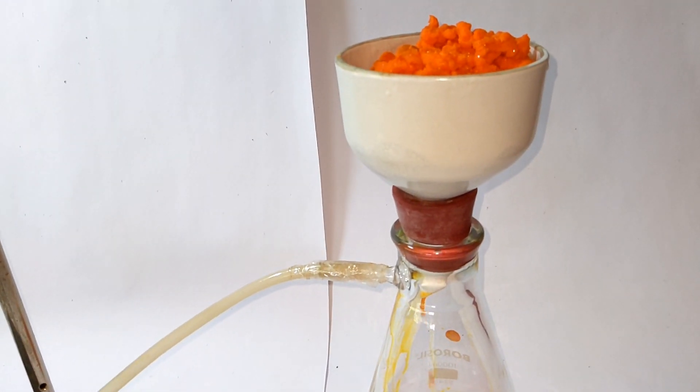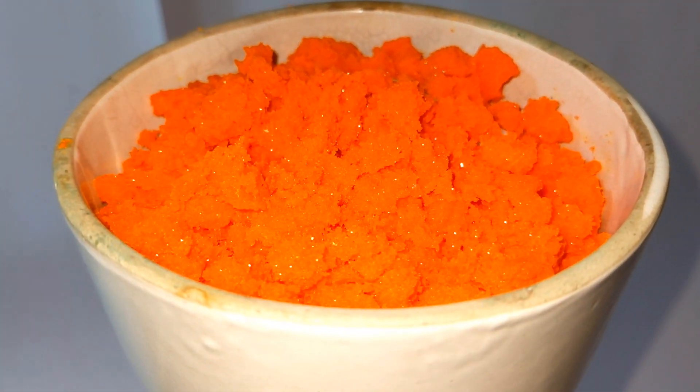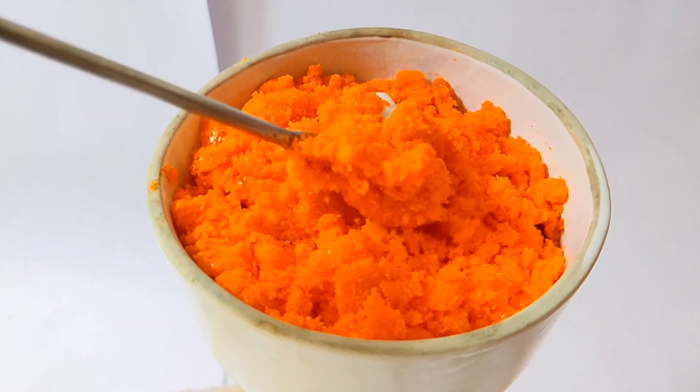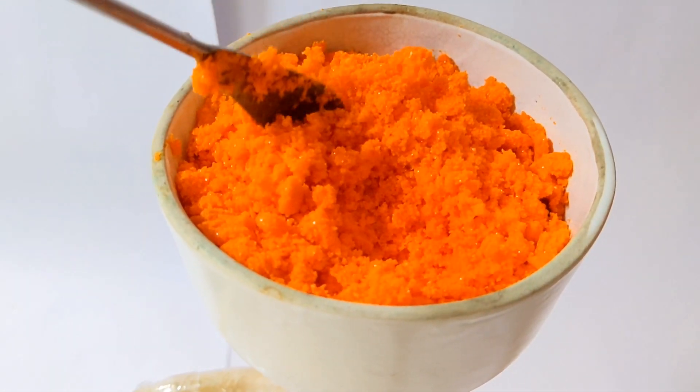This is the crude product obtained after decanting the supernatant solution. It has a bright orange color, very similar to dichromate salt. After vacuum filtration, the dry product is obtained and it was then stored in an airtight container.